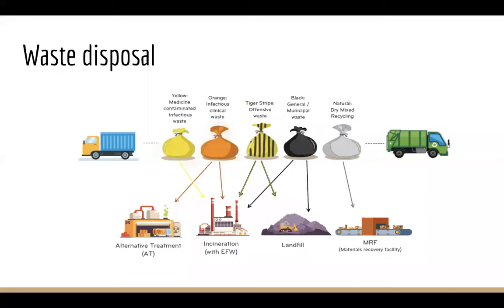As long as you're careful and you follow the COSHH forms and it's been accepted by your local authority, you can do these kinds of things. And in the end, most of your waste will be incinerated, as you can see. Occasionally it'll be alternatively treated, if it's a hazard to incinerate, then there'll be other waste such as landfill or alternative treatment.